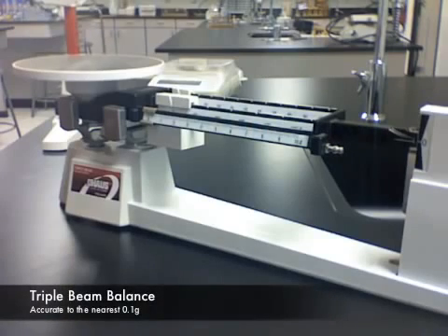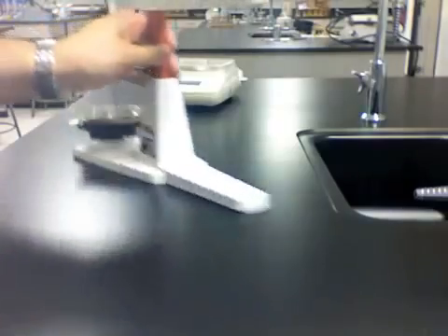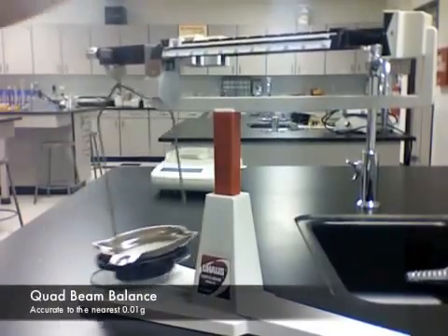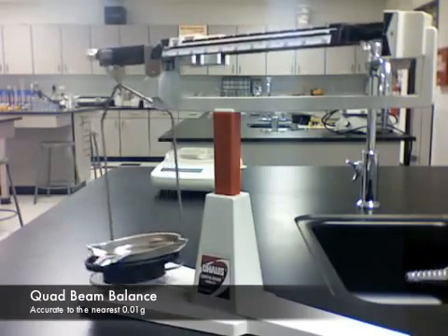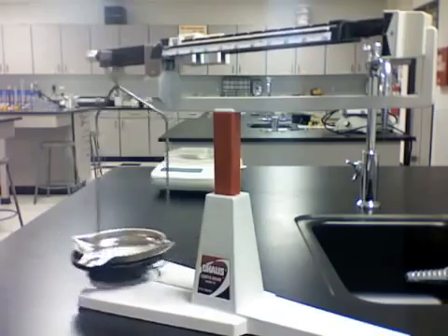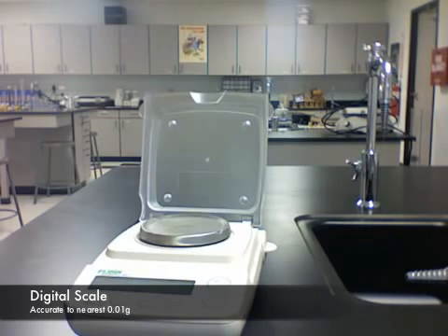What we have here, folks, is a triple beam balance. And we call it a triple beam because there are 1, 2, 3 beams. And we'll take the mass of different chemicals with a triple beam balance. More often than not, however, we'll be using, ta-da, the quad beam balance. Why do we call it a quad beam balance? Because we have boom, boom, boom, boom, 4 beams, quad beam balance. This one is a little bit more exact than the triple beam balance, and so we'll be using this quite a lot in the chemistry lab. When we're not using the triple beam or the quad beam balance, what we'll be using is the handy dandy electric scale, which also measures to the nearest hundredth of a gram.